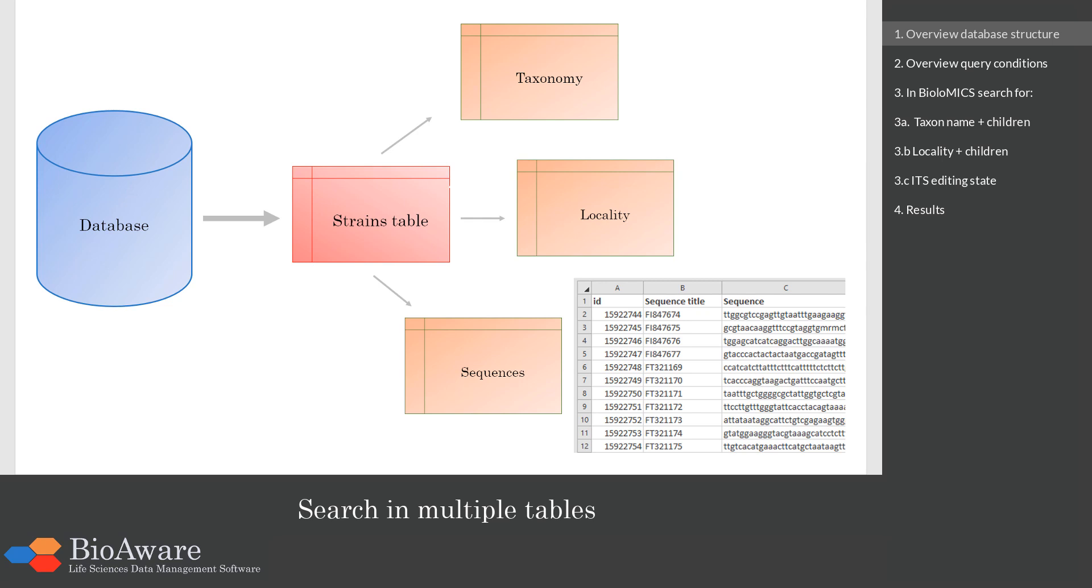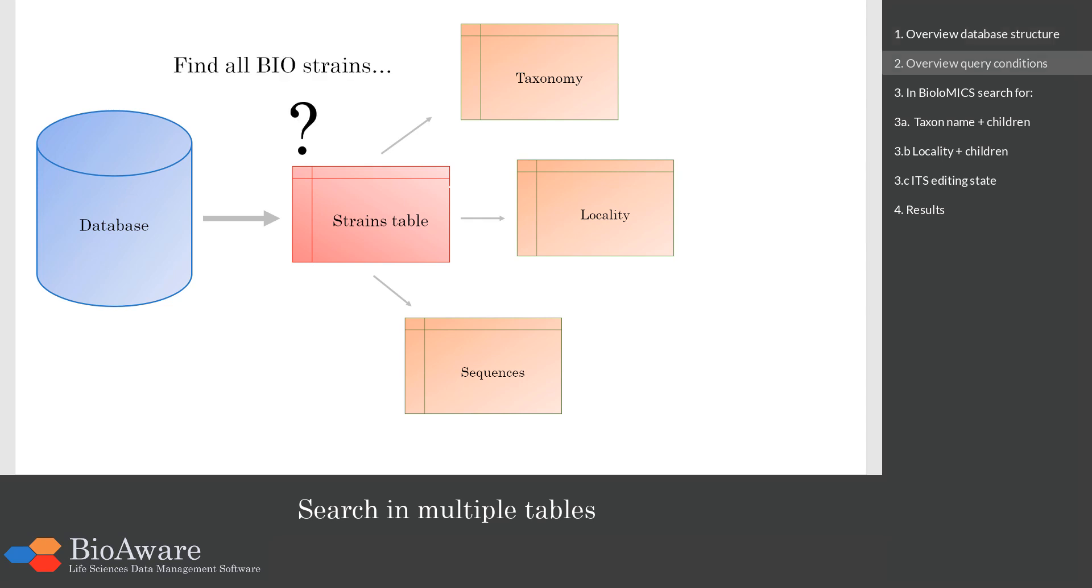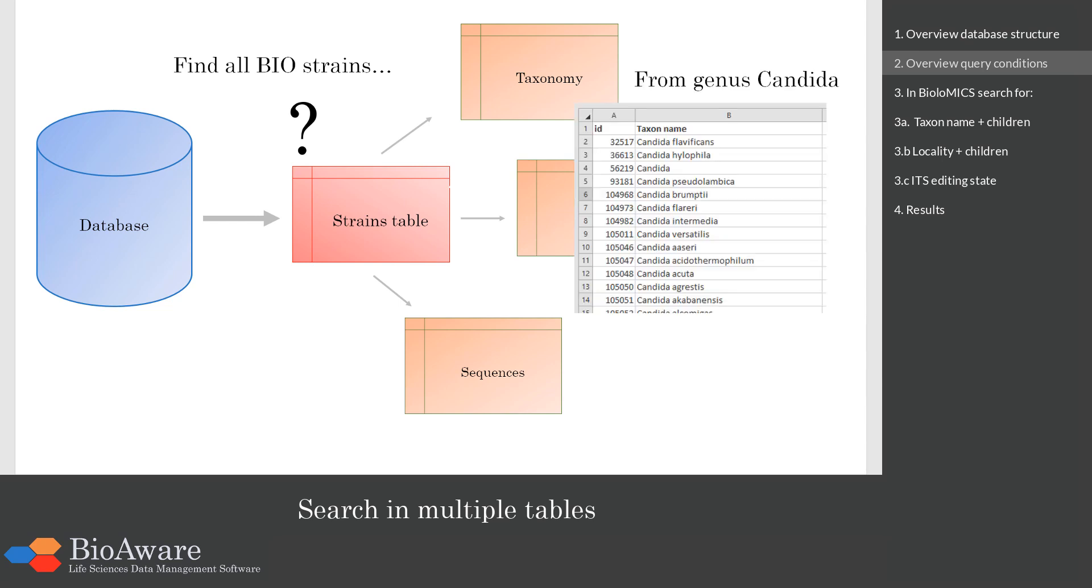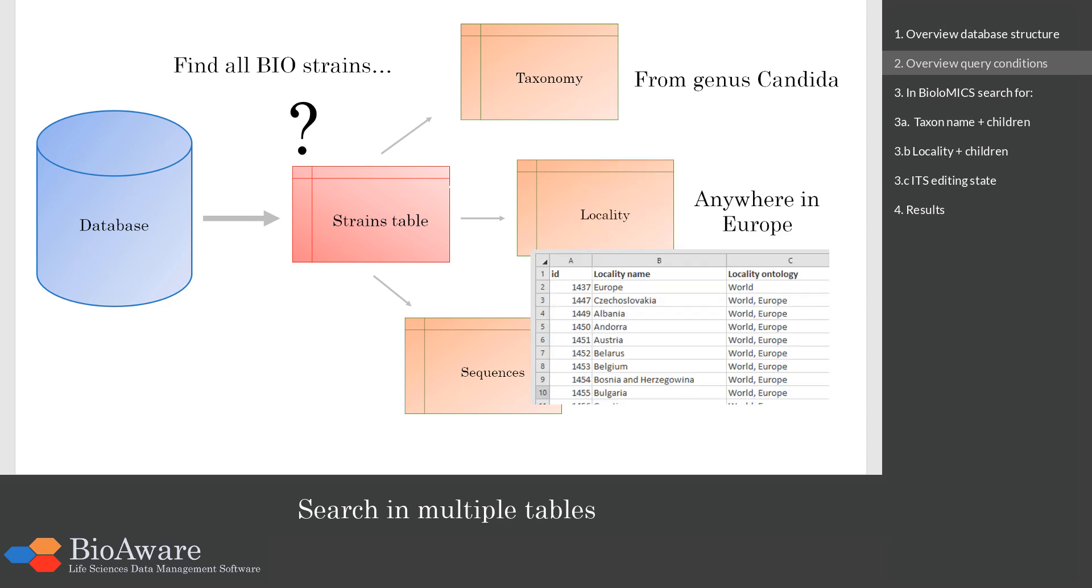Now we want to find all the biostrains records that have a taxonomy with the genus candida or below. So it can be candida but also candida albicans. The strain should be located anywhere in Europe. So this can be Europe or Belgium because Belgium is also in Europe.